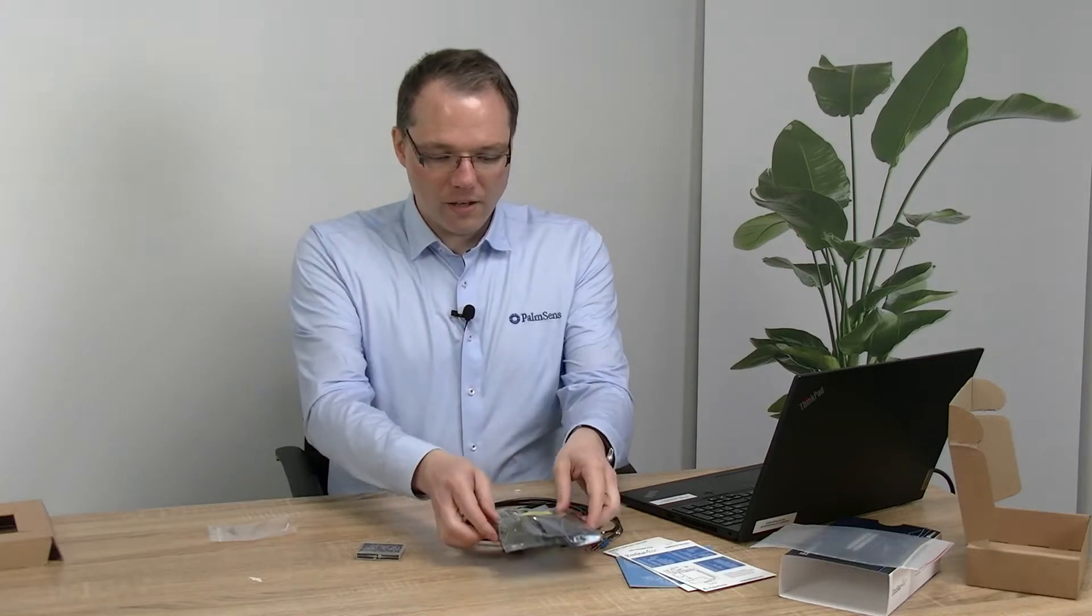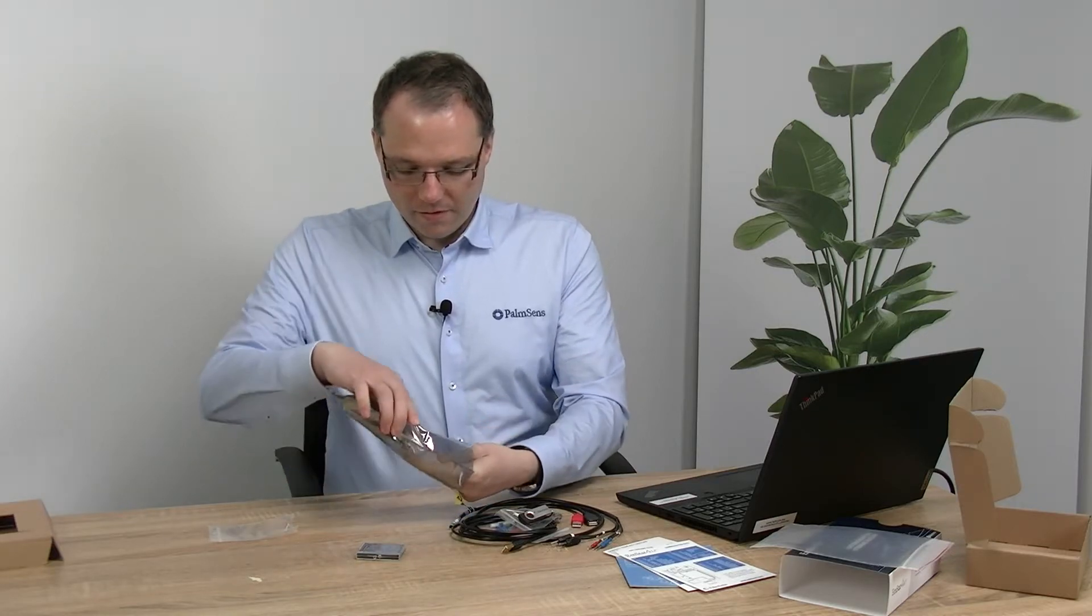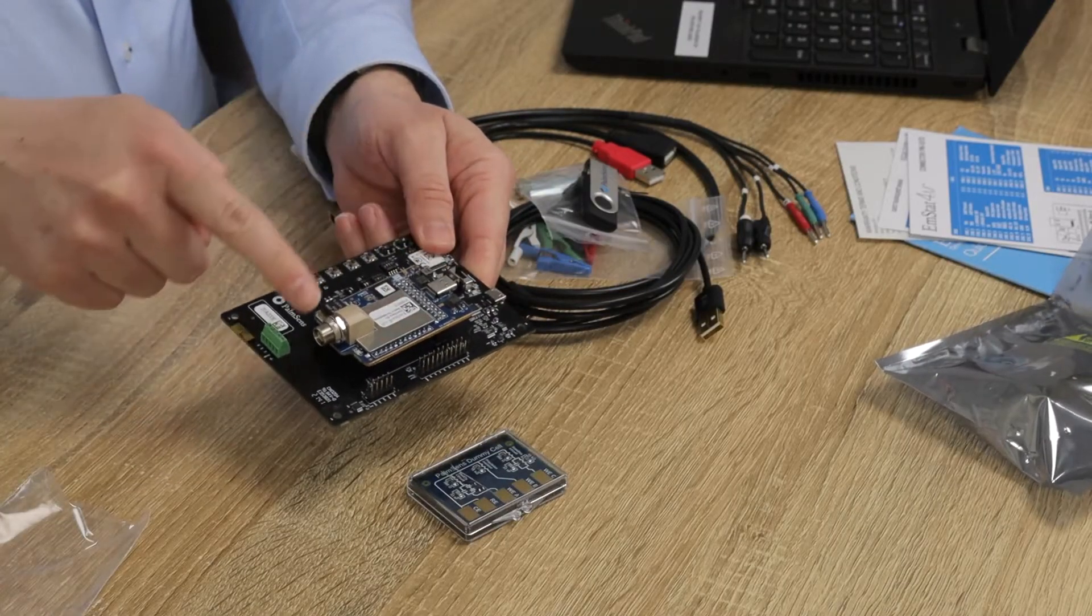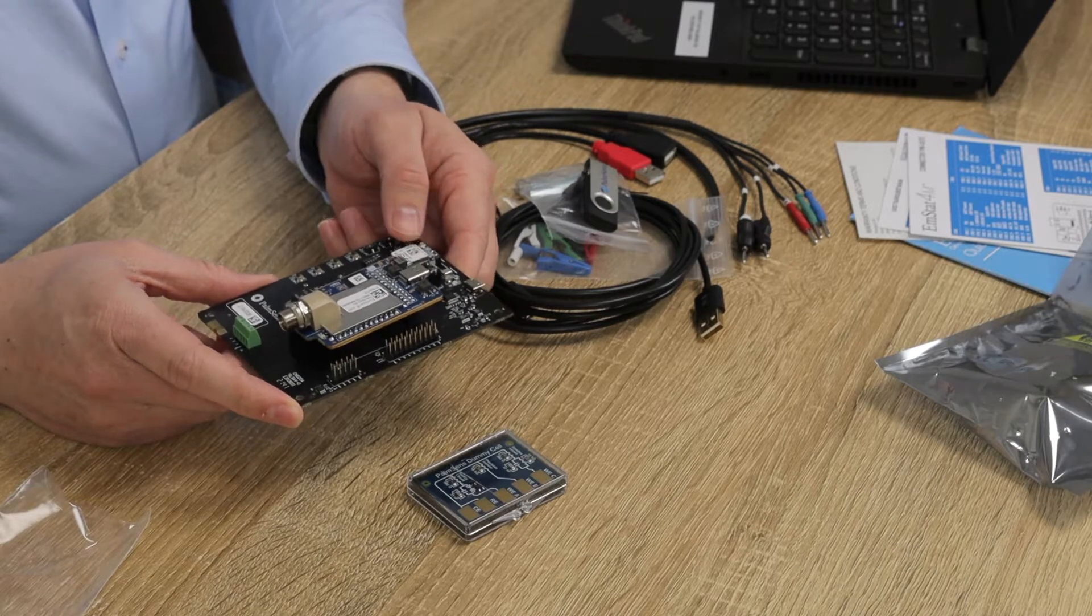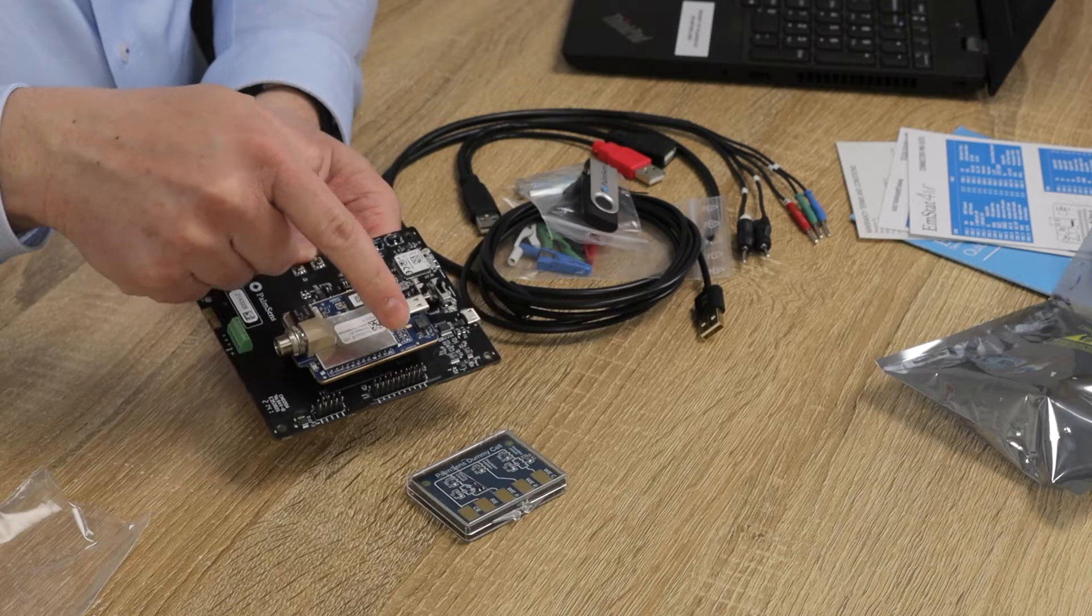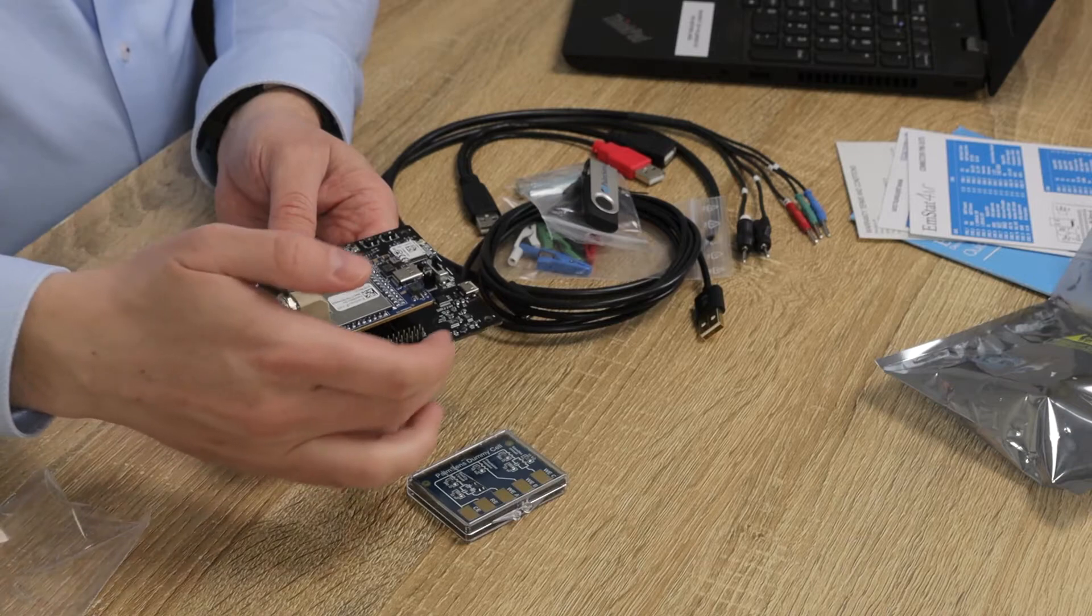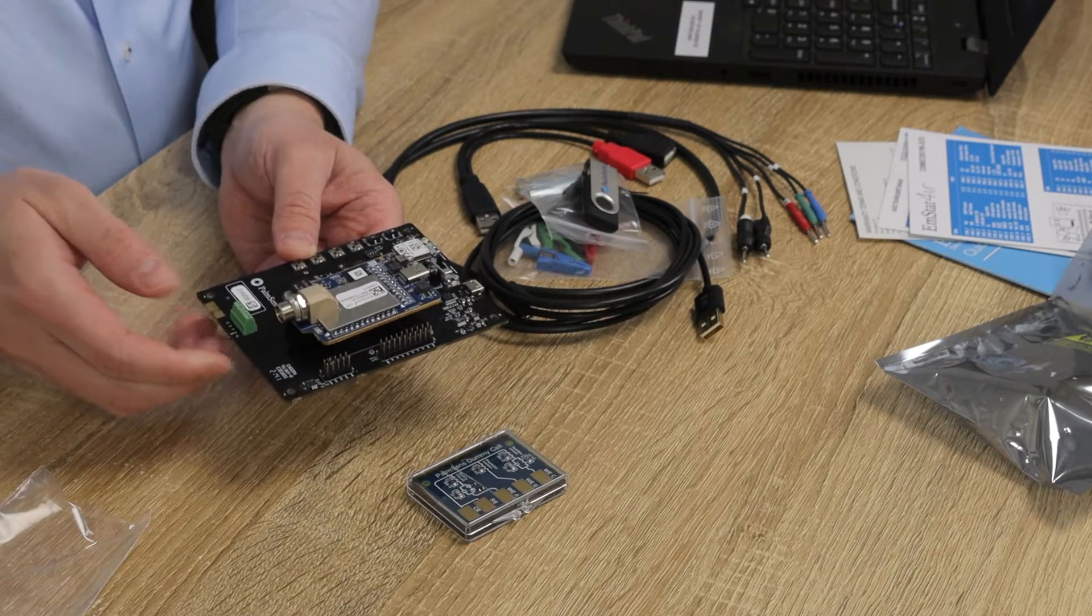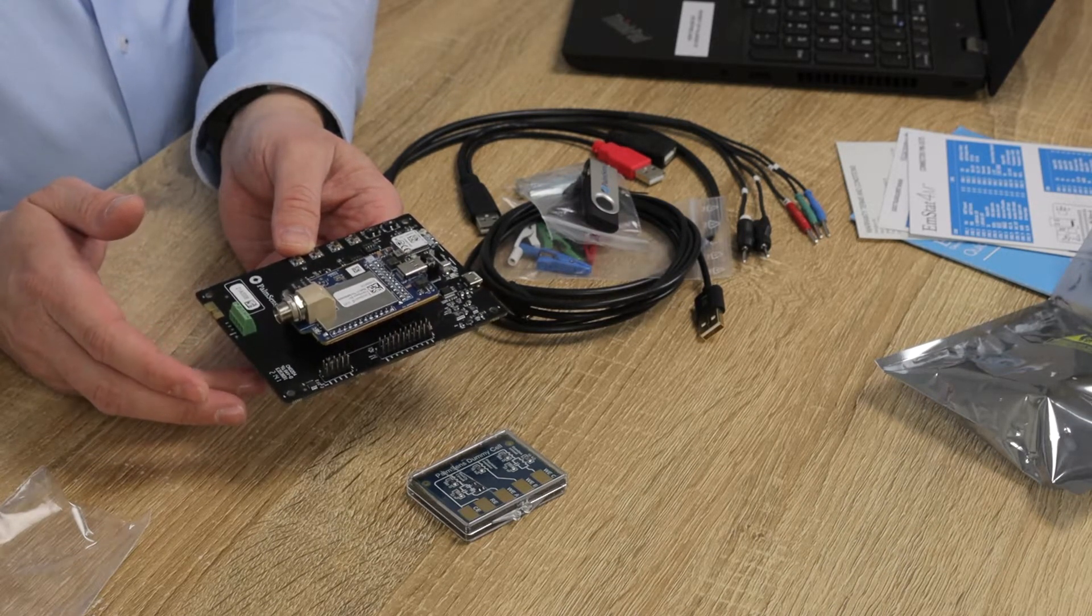Now let's have a closer look at the development board. You see on your development board there's already a pre-installed EmStat 4M module. All the connections that you usually have to solder on your EmStat 4M module are now already pre-soldered for you and pulled out to the different pins of the development board. So you can nicely and easily experiment with the hardware, connect new things, disconnect new things.